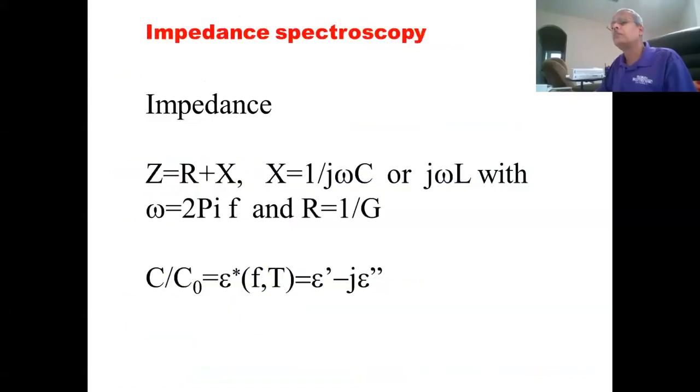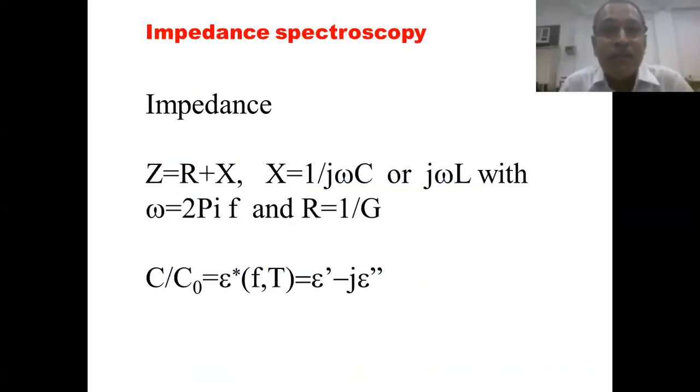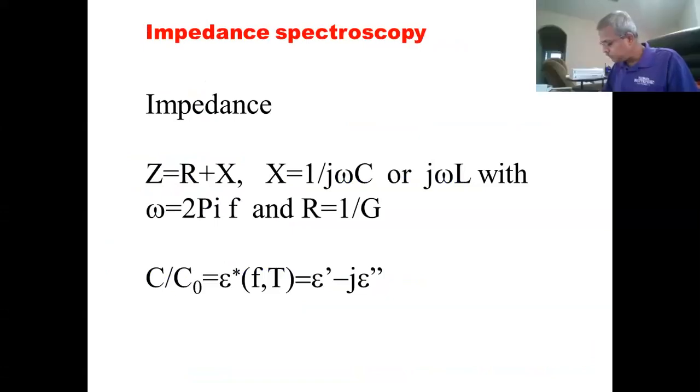Now I am coming to impedance spectroscopy, and there was some glimpse in the previous lecture. This is something very important to me, because many times I have seen that there are a lot of problems in the explanation of the results. So I will tell you what impedance spectroscopy is.